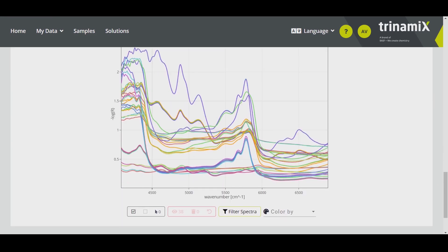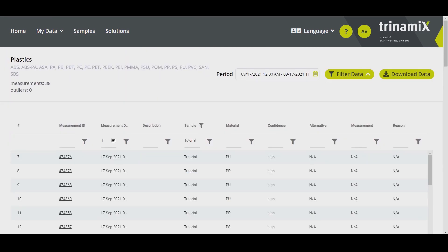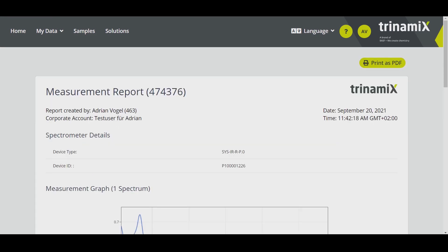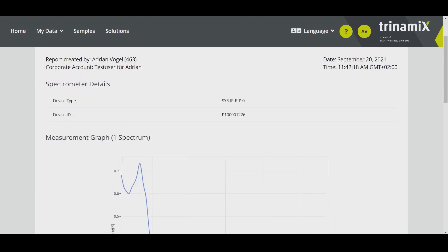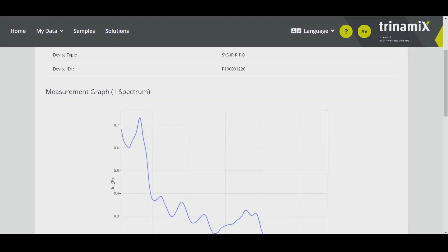In case you want to have a measurement report, please click on the measurement ID and you will find it and can download it or print it as a PDF.